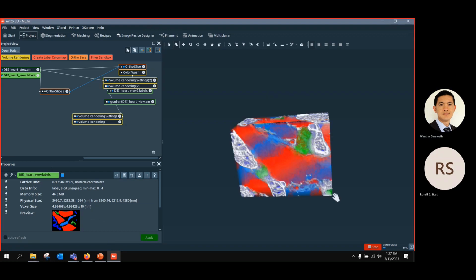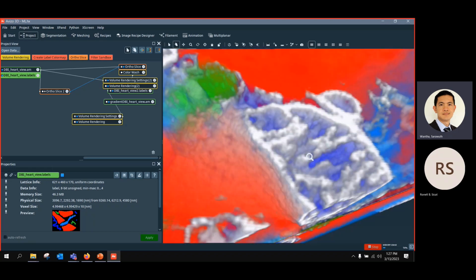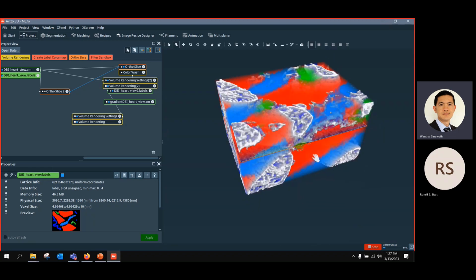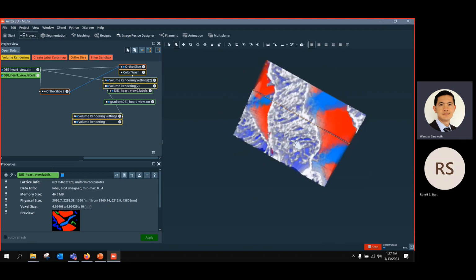So I will remember to upload these two projects from deep learning, the CNNX work and this machine learning, to the file on the website as well, so you can load and see them and try to repeat this training.